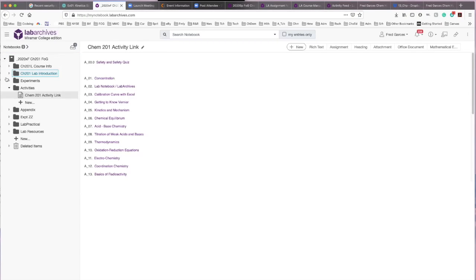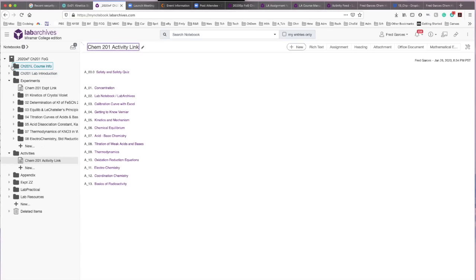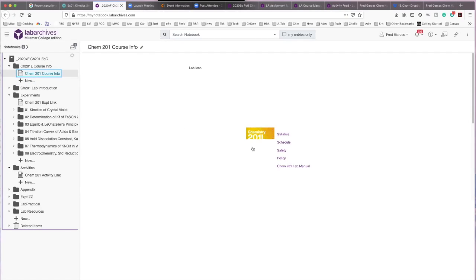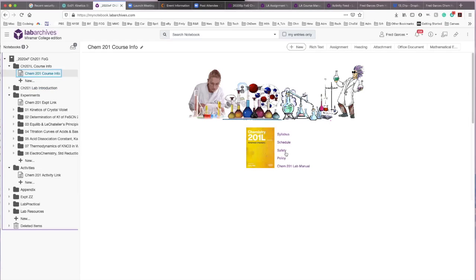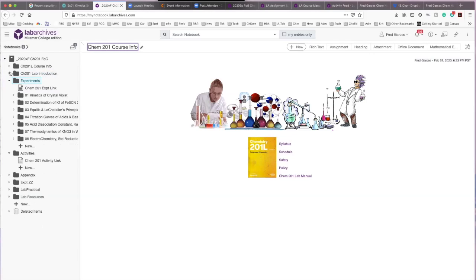I don't know why it did that. It should take you to the fall 2020 course, and the course information is just going to be what the lab is about. Within LabArchives, you can go to the syllabus, the schedule, safety policy, and the lab manual, which is right here. So that's at the very top.